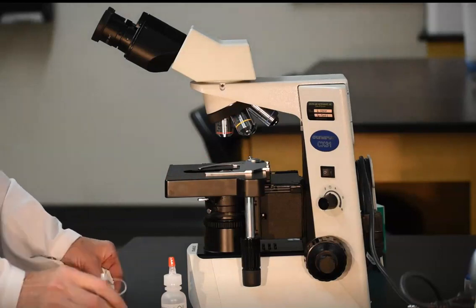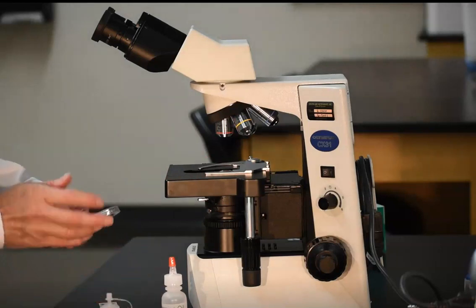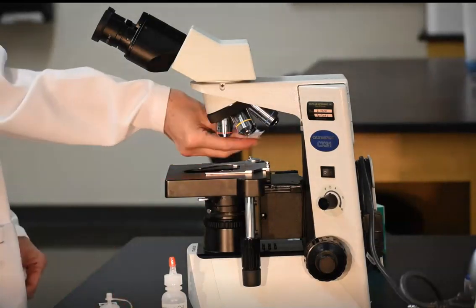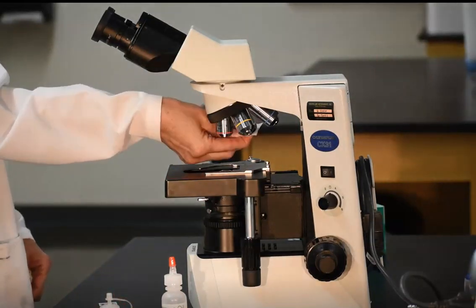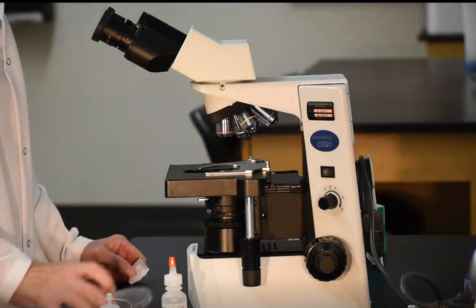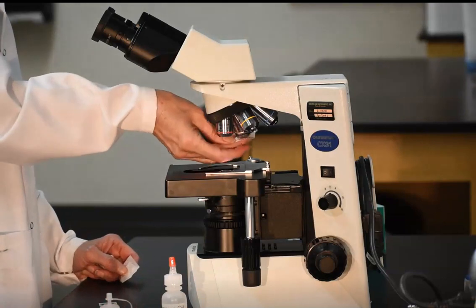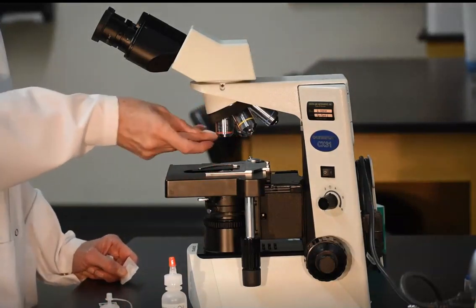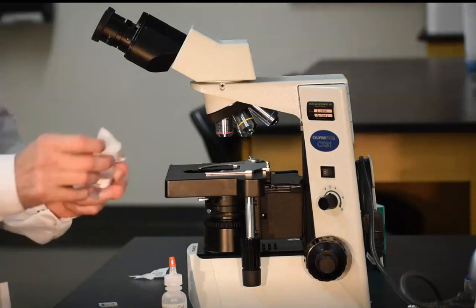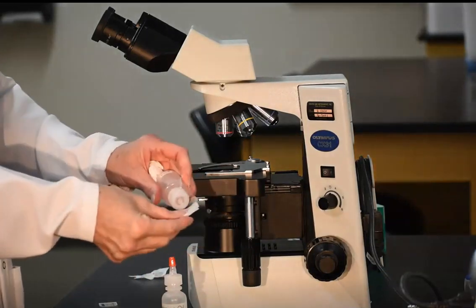You will use lens paper and lens cleaner to clean the lenses. First, blot all the oil with the lens paper. Depending on how much oil you used, it may take several attempts to remove all the oil that has seeped up around the lens. Press firmly up on the lens. You will feel it move up slightly. This allows the oil to be completely removed.